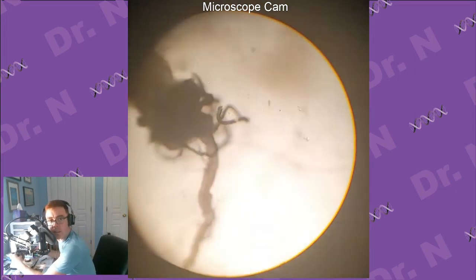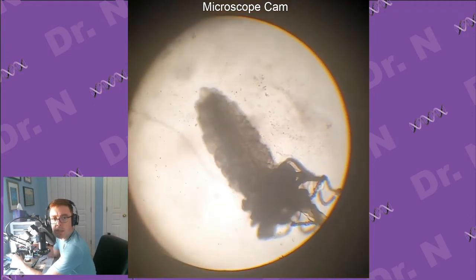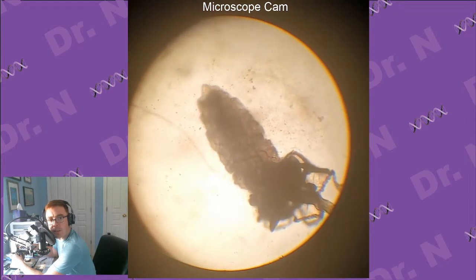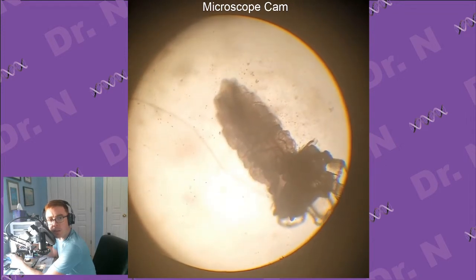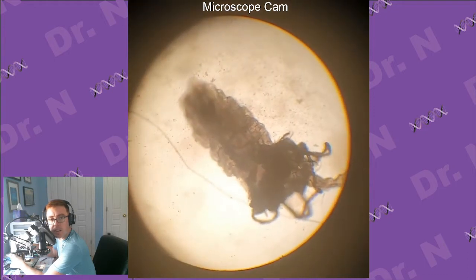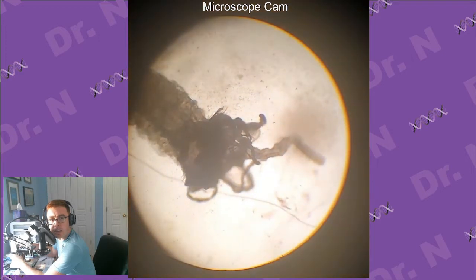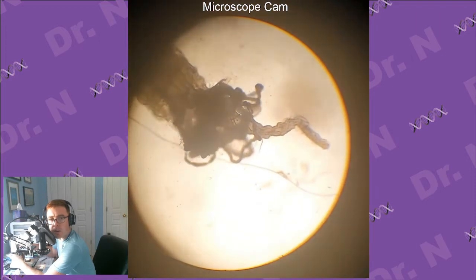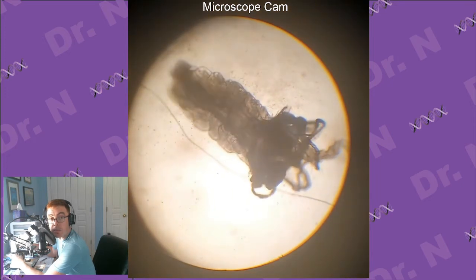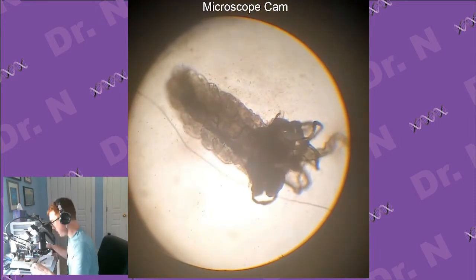Okay, so that is him split in half. A lot of his organs have started to come out. Yep, that's the head. Great, I grabbed the right side. So coming out of it, you can actually see some more of those tubes and part of the gut. So now this is very hard without the microscope, and I'm going to try to invert it. So turn it inside out.